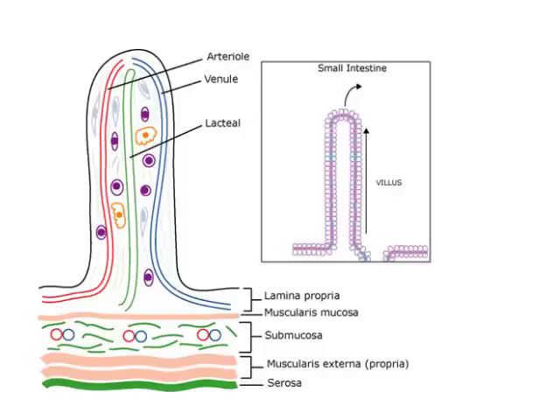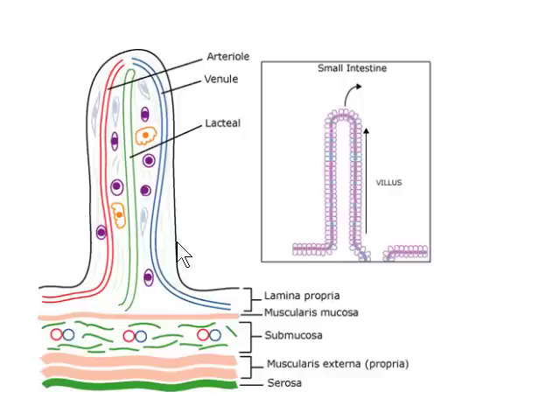Let's take a look at the specimen on the slide, which is of small intestine. Before we get to that specimen, I want to show you a quick cartoon diagram of the way the epithelium in the small intestine is organized. Looking at the diagram on the left, the wall of the small intestine is thrown into a very large number of upward projecting, finger-like folds, and these folds are called villi.